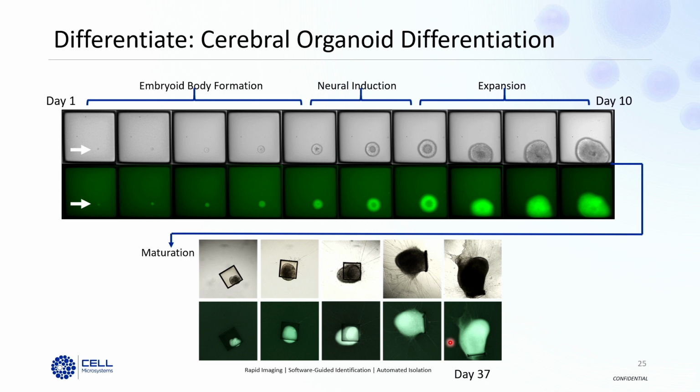At the lady, and then I'll come to you. So I was wondering, for the organoid in this example, you seed by single cells, but for the adult organoid, do you also seed by single cells? For the adult stem cell derived organoids, you can do single cells or you can do fragments of cells. If you're not interested in clonal organoid generation, you can take your dome of organoids, mechanically dissociate them into fragments, and put them on the array. Then you're going to get from fragment to organoid much faster on the array, and ultimately be able to do your downstream assay, whatever you're interested in, much quicker than this time course is showing you.